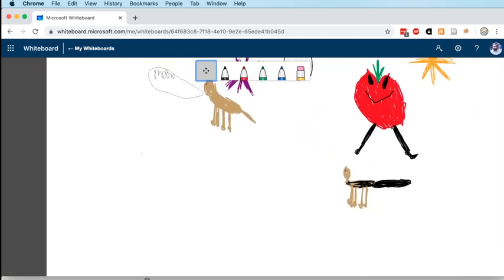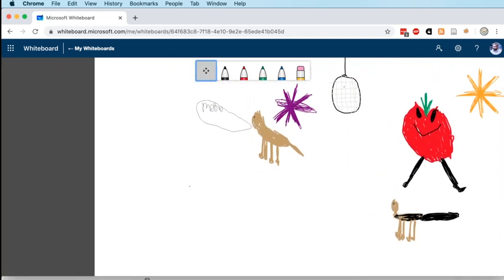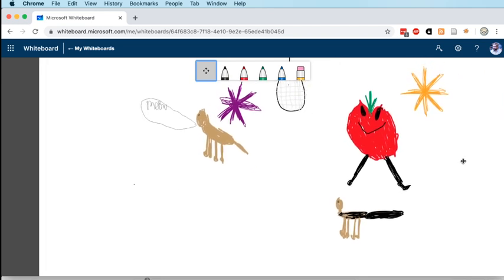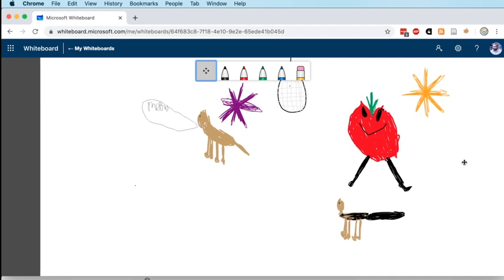Okay, so volcano plots. I'm going to draw around Jacob's picture a little bit. I'm not going to delete it. So a volcano plot is a fairly straightforward thing.